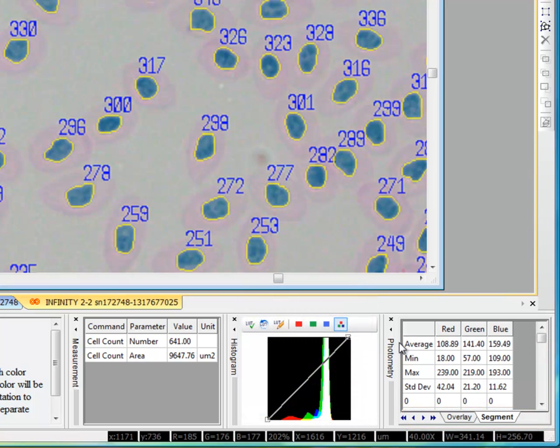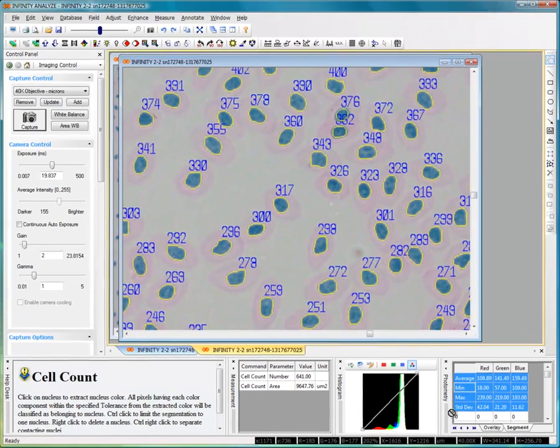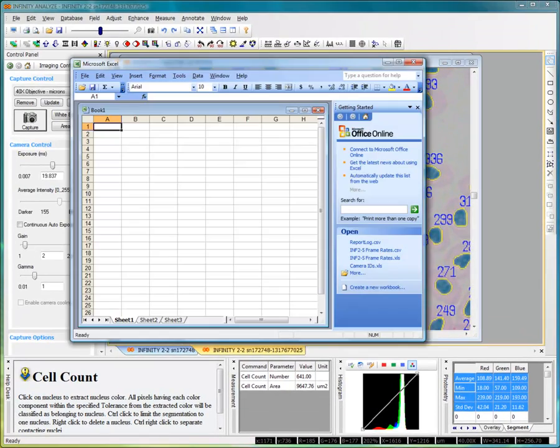As with the measurement window, as we've shown in other tutorials, you can highlight areas in the photometry window with the mouse and then click on them. If you have an Excel spreadsheet open in your tool tray and you drag your mouse over it, it will open the Excel spreadsheet, and you can release the mouse when you're in the Excel spreadsheet and can now perform simple operations on the spreadsheet for your results.